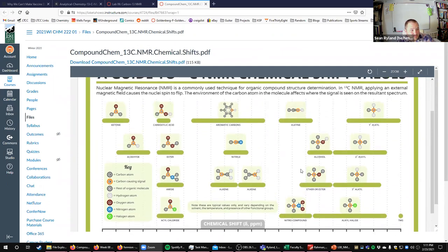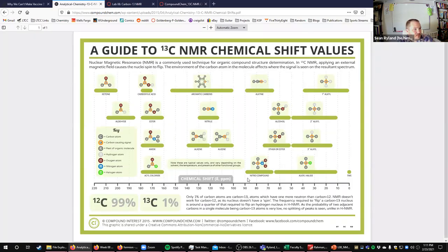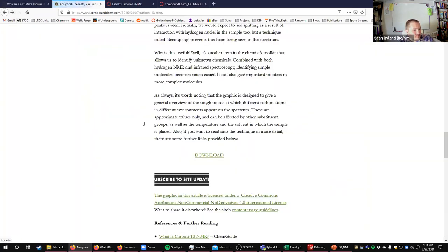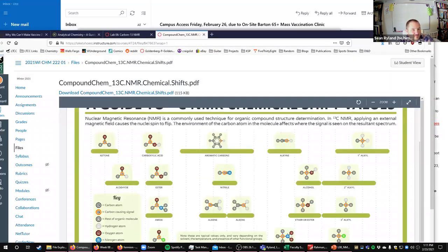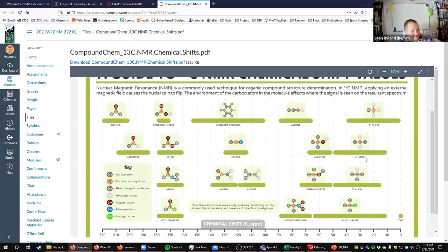And so the nice thing about carbon 13 NMR is that, I guess it's not that, I'd say there's less information here. Sorry, I lost the figure that I wanted to use. There we go. They don't have any splitting, because the only reason we saw splitting with the proton NMR was it was based on how many hydrogens were next door, right? And you had to have the hydrogens nearby in order for those magnetic fields to interfere with each other. They call that coupling.